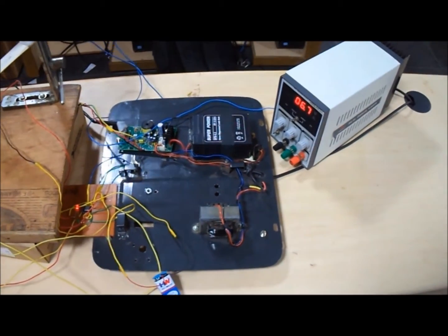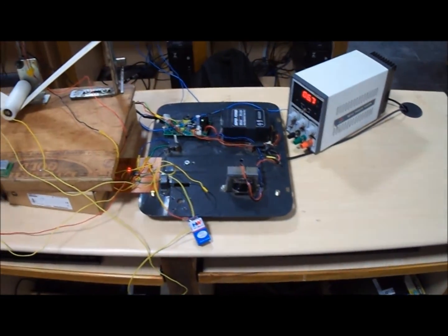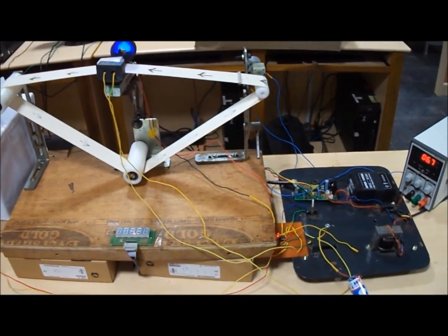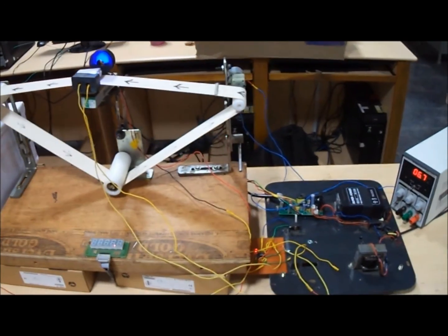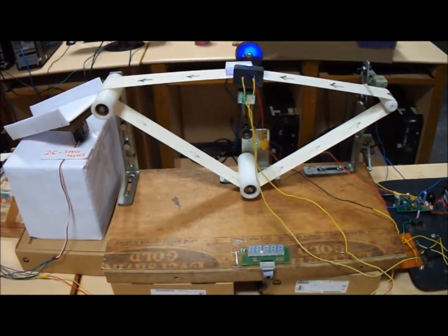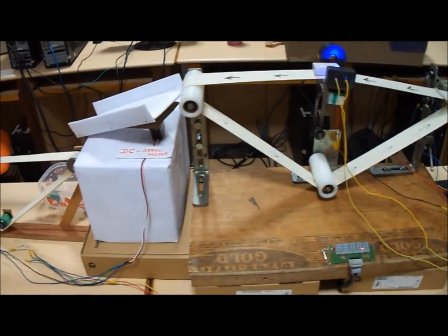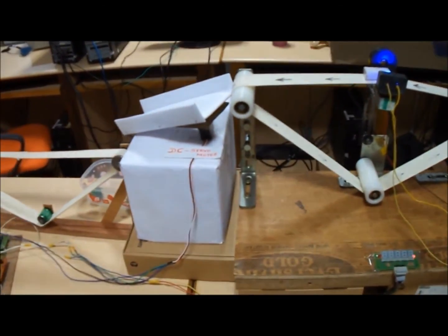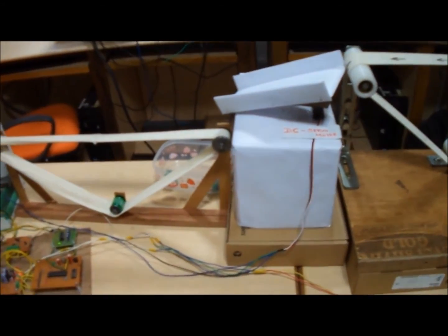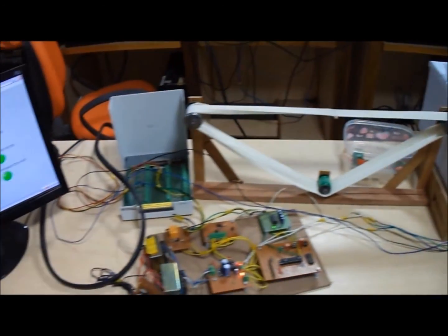As we have seen previously, the initial process of drug manufacturing is formulation. During formulation, the ingredients are manually weighed. If the composition of these ingredients varies, then this will result in serious health issues. The proposed model is designed in such a way that the ingredients to be mixed are placed over a conveyor belt and weighed using a pressure transducer. Correspondingly, the weight and the required parameters are analyzed in the LabVIEW platform. Through the shielded connector board, the control is given to the Atmega 8 microcontroller for the segregation process. A servo motor controlled by the Atmega 8 microcontroller is used to operate the system for accurate segregation of the ingredients.